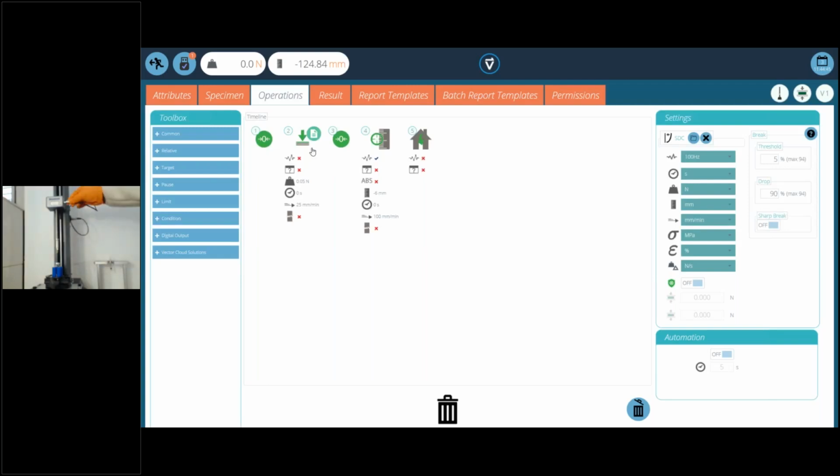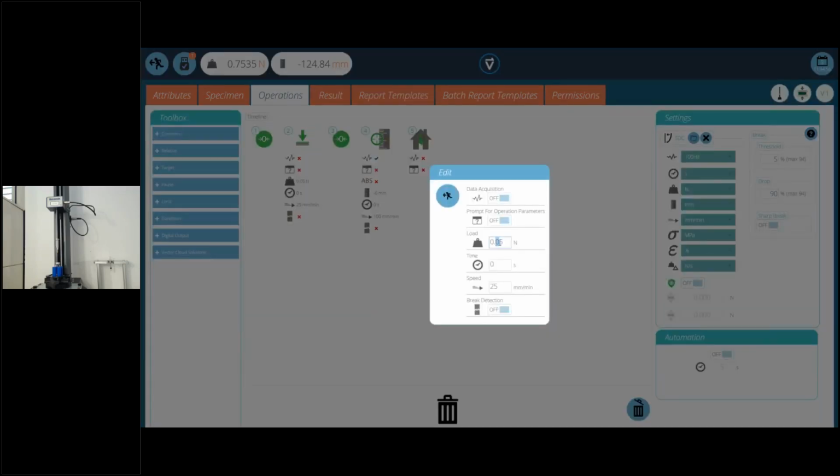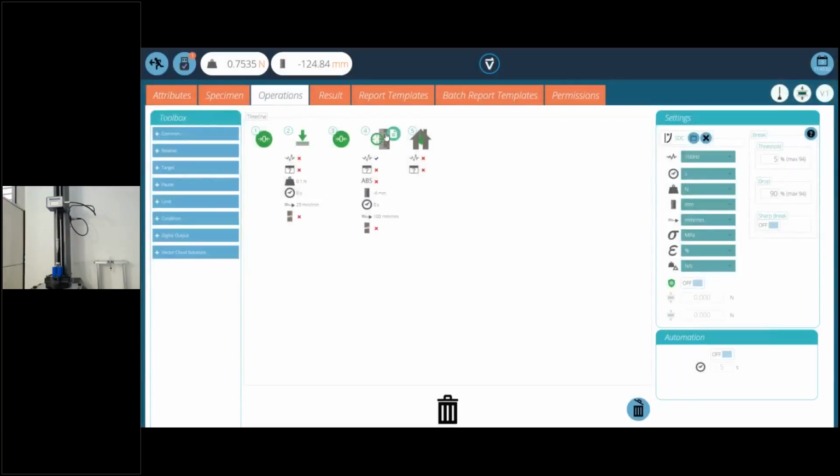Good idea. Plug in the load cell. There we go. See a few more zeros. Okay. It's a zero-all run to a touch. Let me just increase the touch a tad bit so it's not ultra sensitive. This time, it's only going to run to 6 millimeters, which is all we need for the penetration force. And then at the end of the test, we want to return home. The units of measurement remain the same as the last.